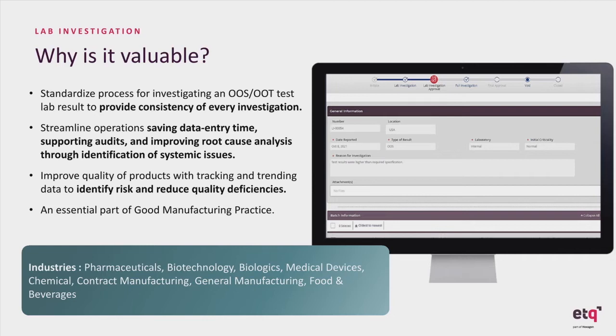And then also it will improve the root cause analysis through identifying the systemic issues that you're having. It also improves the quality of the product from tracking and trending these deficiencies and overall helping the quality of your product. And also, it provides a good manufacturing practice by following these steps in this automated system.